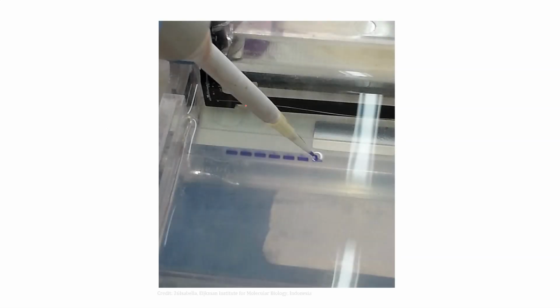We use a tool called a micropipette, which is an instrument that allows us to administer a very, very small volume, usually in this case about 20 microliters. What we're seeing here is they're loading DNA into those wells. The DNA is purple because it's dyed with a loading dye, which allows us to see which of these wells has DNA in it. The loading dye also makes the DNA heavy, so it sinks down to the bottom of the wells.